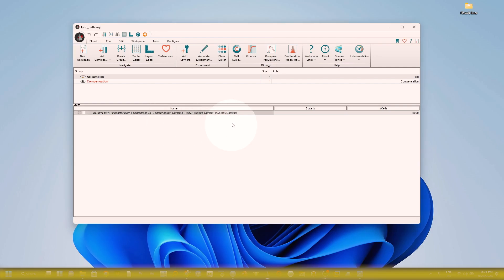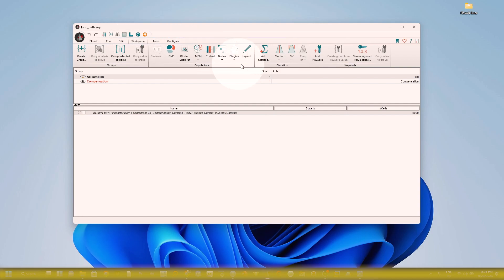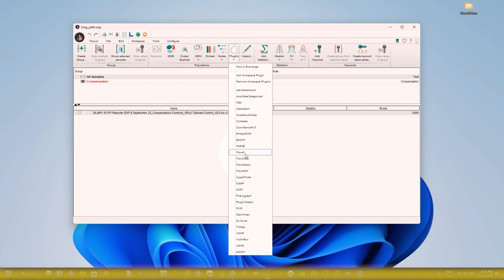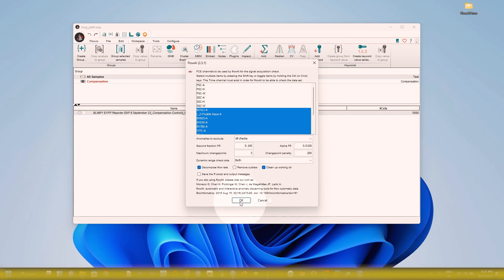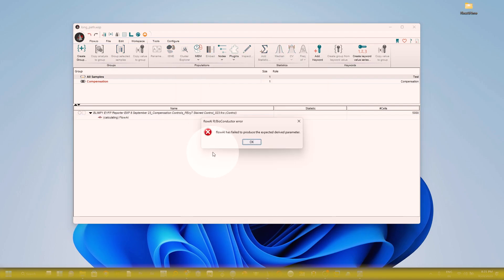Here I'm showing an FCS file. If you go for FlowAI cleaning, click on the Workspace tab, then Plugin > FlowAI, and click OK. Here you can see the FlowAI Bioconductor error: 'FlowAI has failed to produce the expected derived parameter.' This is the error many people are facing.